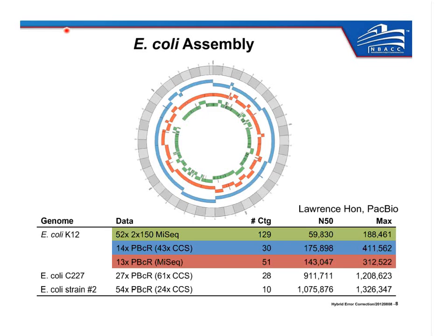However, in this case, the CCS seems to work a little bit better, though it's more expensive. So our goal is to find the sweet spot. If we want to use CCS data, does it work better, but the MiSeq is significantly cheaper? So can we use cheaper MiSeq sequencing? Do we need CCS data? We want to explore those options and see which ones work best for assembly.